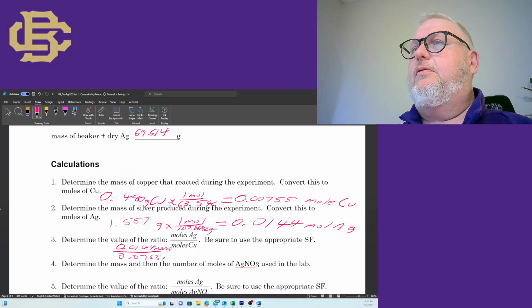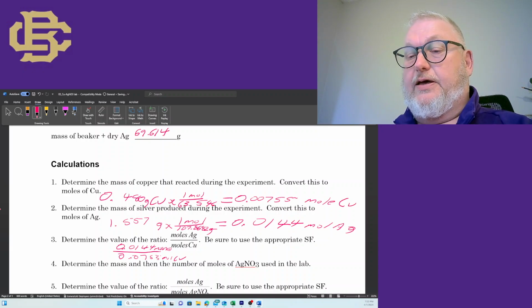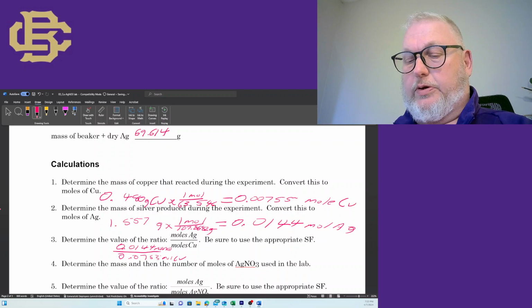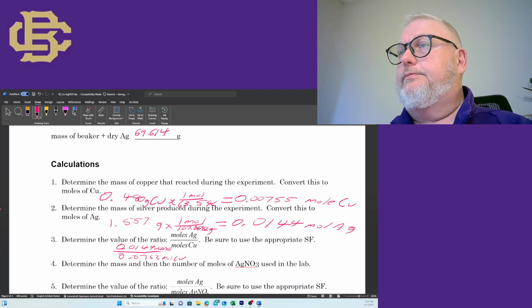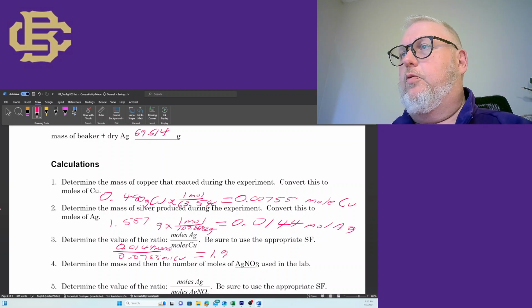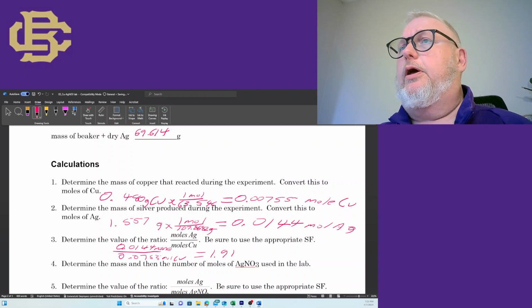Let's see what we get. Ooh, I got 1.91. That's my ratio. That's almost 2 to 1.